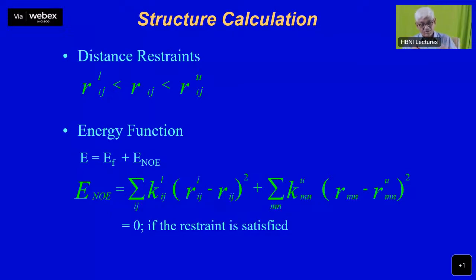Okay, so now we got the coupling information. We also, from the NOESY spectrum which I showed you earlier, can quantify the intensities of the peaks and calculate the distances. I showed you the distance information for the various peaks.